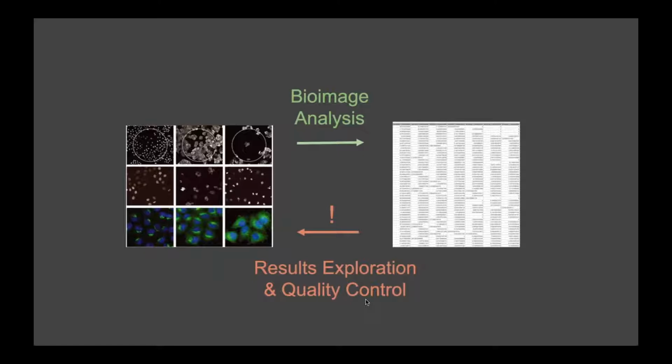And you should be curious as a scientist: why is there this high number in this column? That means you want to actually see how the object in the image looked like that produced this high number. And that can be a bit tough because if you have this table open in Excel, how do you find back the cell that this number belongs to?